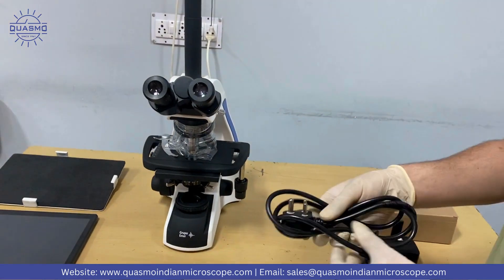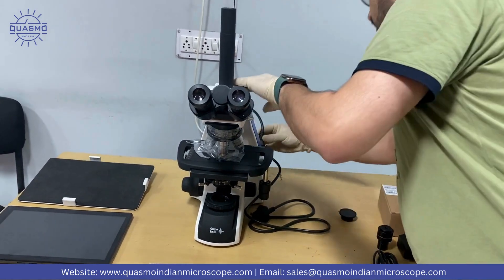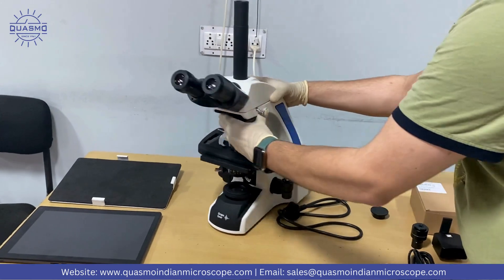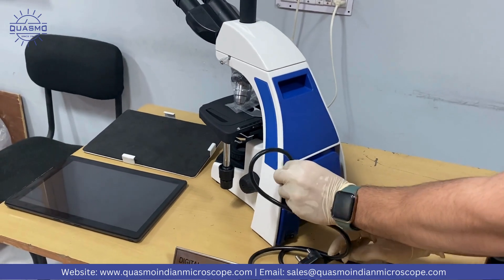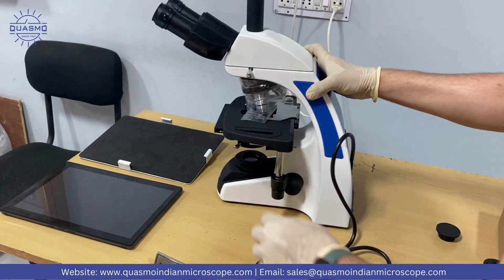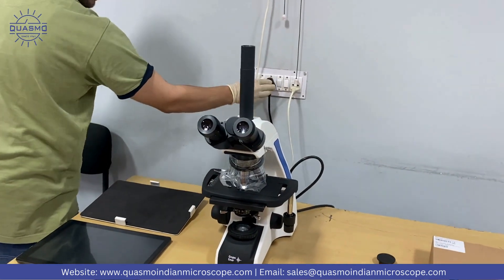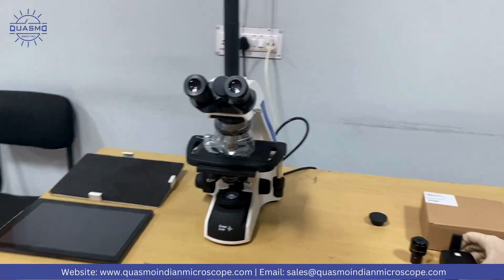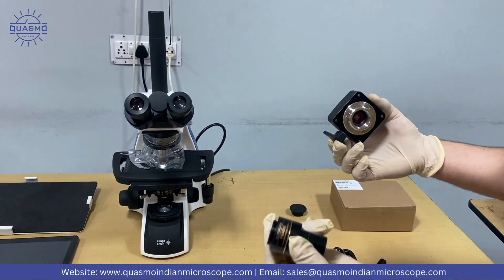The next step will be to connect the microscope with this cable. I'll show you right there — we have a connecting port. The next step will be to connect the camera. This is the C-mount adapter.